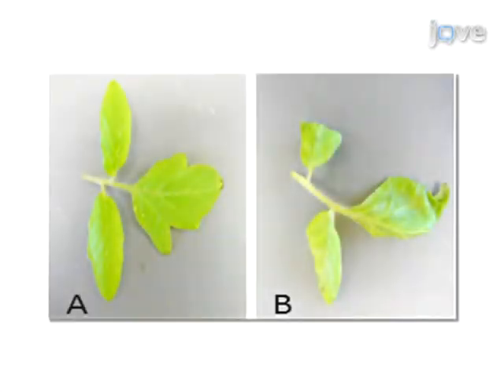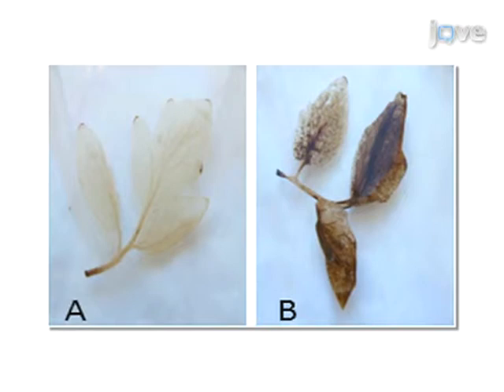This image shows examples of a control tomato plant leaf on the left and a Pseudomonas inoculated leaf on the right. After the leaves are stained using DAB, the destaining process allows for the histochemical stain to show signs of reactive oxygen species in the leaf tissue. As expected, the control shows no significant staining, while the leaves treated with Pseudomonas stain positive for hydrogen peroxide production.